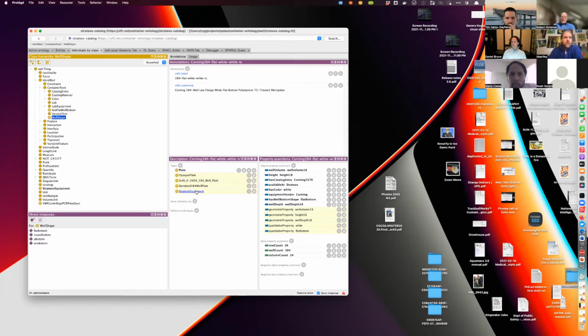I guess the real answer is that it depends on how portable you want your protocol to be. And I think this is actually a good example.